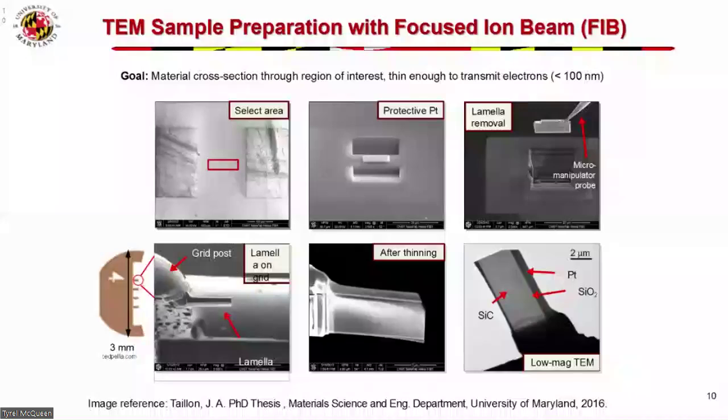And then you bring a nanomanipulator close to the sample, and it touches here. Basically would be right here. It would touch when this is thinner, and you deposit with the gallium ions of the FIB. We use gallium ions. You can actually deposit by introducing a gas.